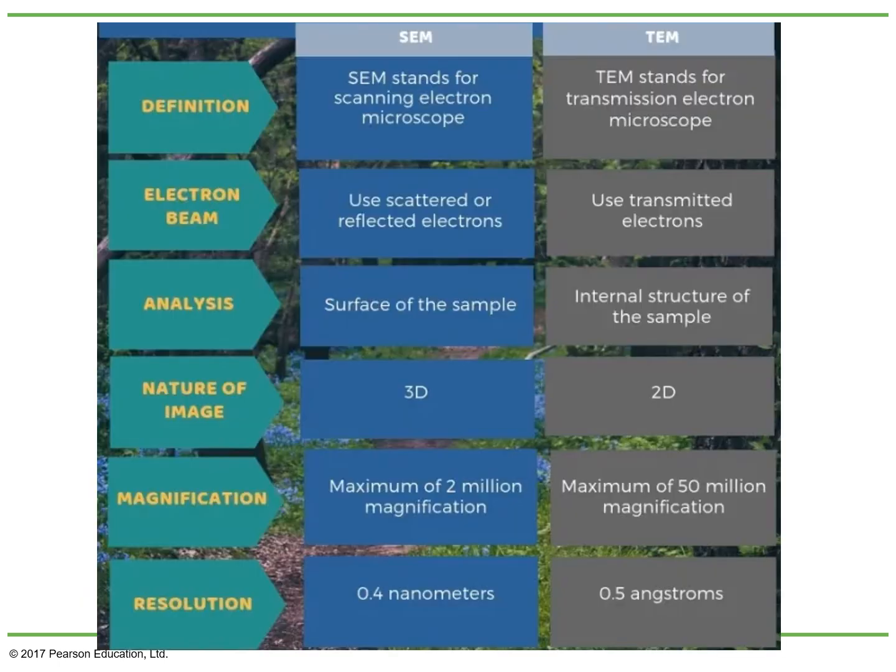Okay, so now I hope that you enjoyed that video. I'm going to give you key points so you remember for the test. So first, electron microscopy is divided into different types of microscopy. The first one is the SEM, and the second one is the TEM. The SEM is the scanning electron microscopy, while the TEM is the transmission electron microscopy, and both use an electron beam. We are not using light, white light or fluorescent light. Here we use electrons, and we use them in different ways.